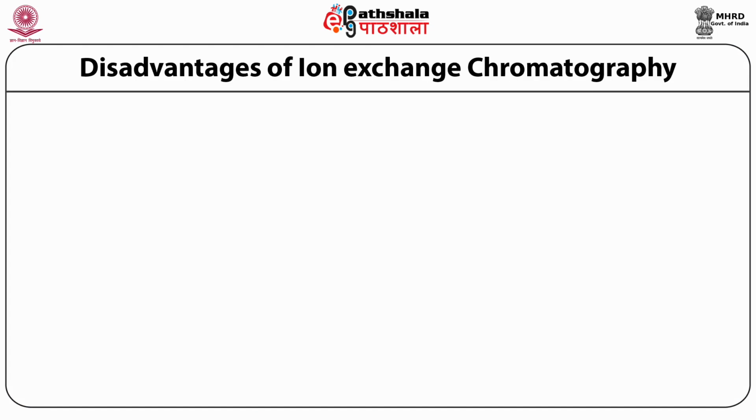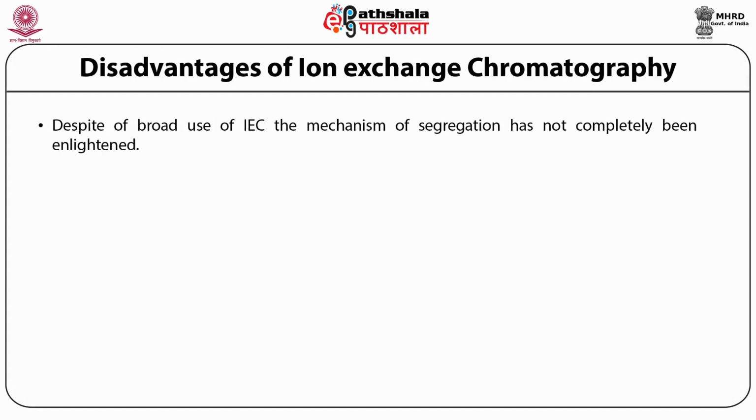Disadvantages of IEC. Despite the broad use of IEC, the mechanism of segregation has not completely been enlightened, and extensive effort has been made to depict the ion exchange process more theoretically.